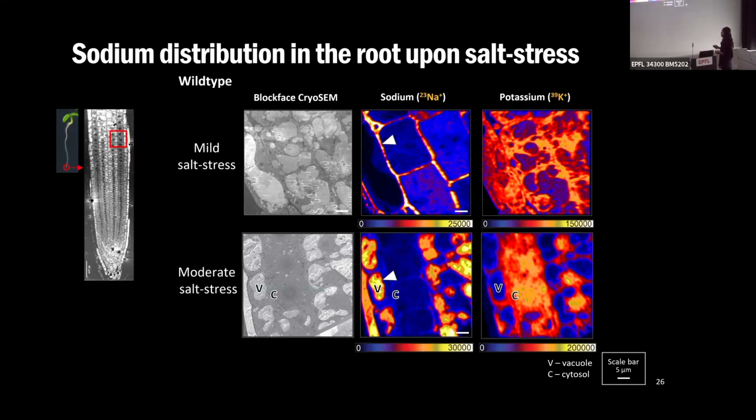You see that the vacuole is strongly taking up all of these excess ions, and it neatly shows us in the picture that when the plant has too much of these ions, which it does not like, it starts to actively transport them into these little vacuolar structures. And then you see that these ions are now transported in there.